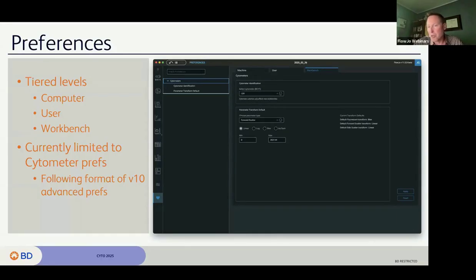And that's what all of your workspaces get, those preferences, unless you, the user, have a workbench that you want to be different in terms of what its preferences are from your typical setup. So if it's the extreme outlier, this one workbench should just have its own set of prefs that are different from everything else I've ever done. Cool. Set some workbench prefs. And then you've got very fine levels of control for the preferences.